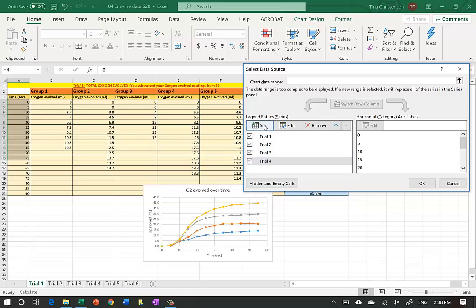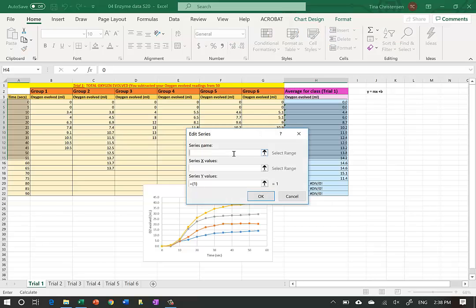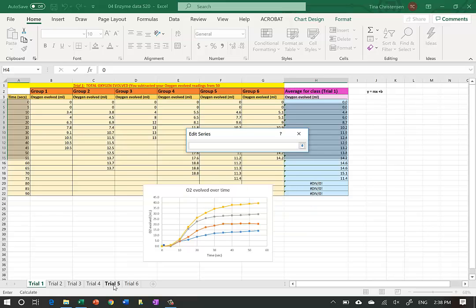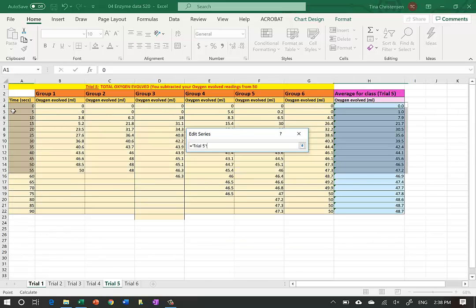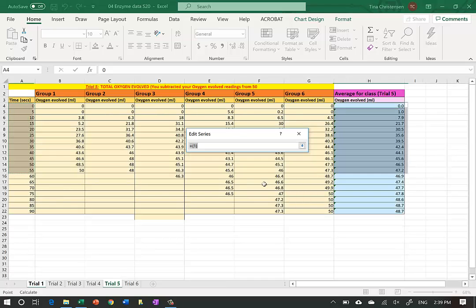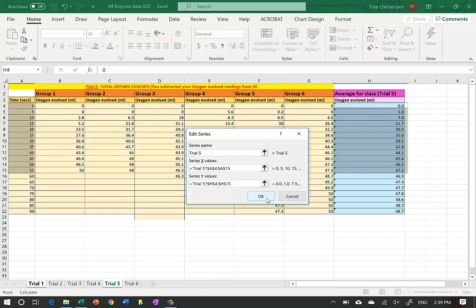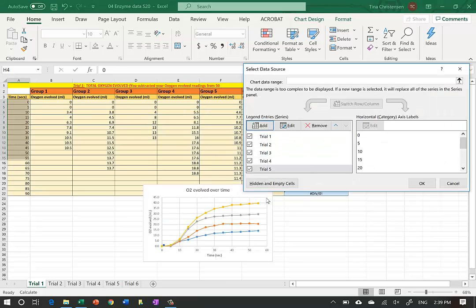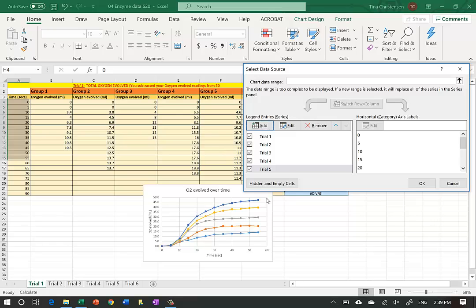A fourth line appears in yellow - that's Trial 4. Now I'll add Trial 5. I select data, go to the Trial 5 tab, do zero to 55 seconds, then select the Y values still on that tab. I hit OK and get the next line, which is dark blue.